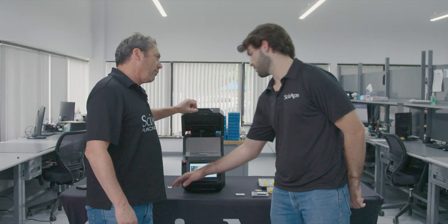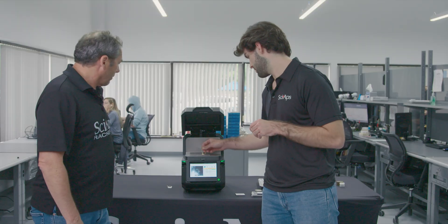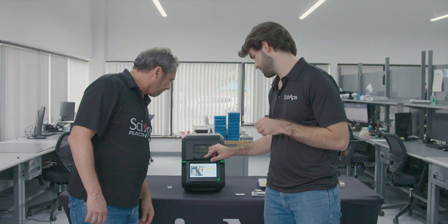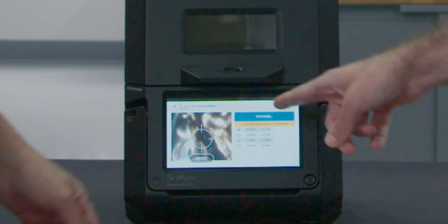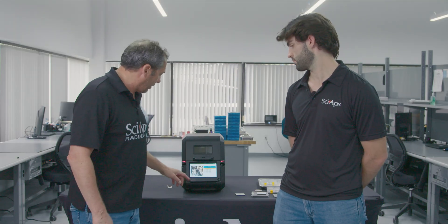We didn't show the plating alert yet — let's do that. Here we have a nice gold bracelet. Stick it on there, and right away, within a second, it alerts you: gold plating possible. That alerts you to the fact that if it's gold plated, you don't want to pay 18-karat pricing for it.